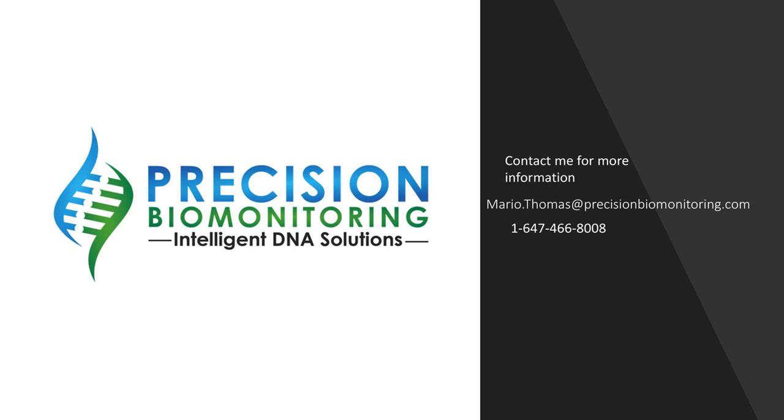Now a question from Scott Taroff that is related to the previous questions, but brings a deeper level. The question from Scott is: can eRNA and eDNA markers be used simultaneously within the same qPCR reaction to obtain data on, for example, comparing species presence versus functional gene products of those species? Or would the two marker types interfere with each other in qPCR?